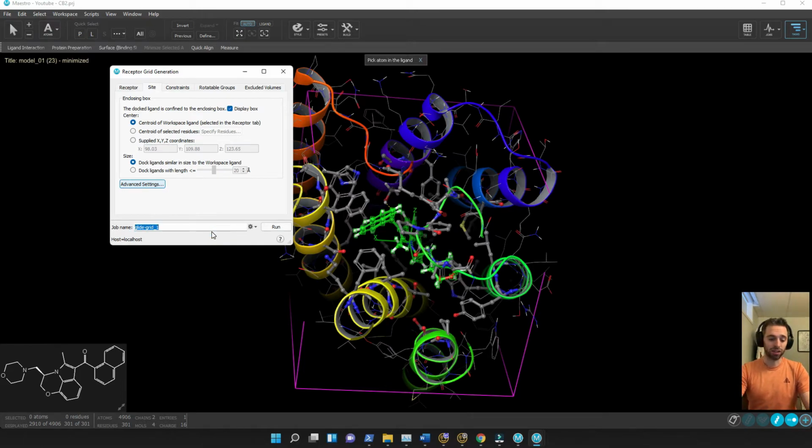We can name the file. This is our CB2 grid. And then we can put the date. Today's January, for me, January 30th. We can run this job.